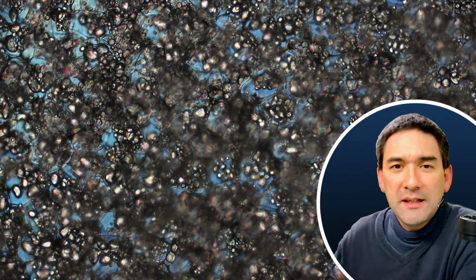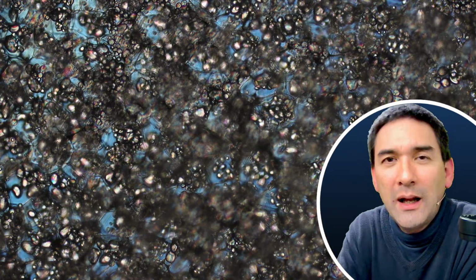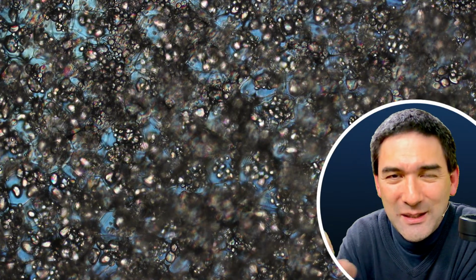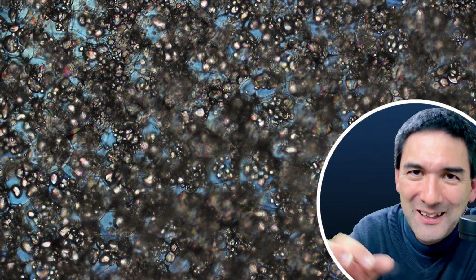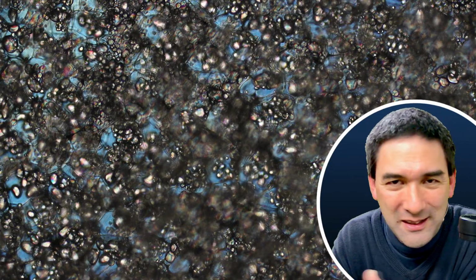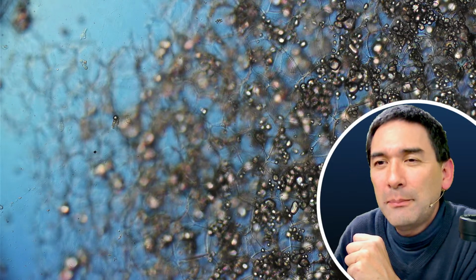I was basically saying that sometimes you could take the iodine and add it to the specimen while the slide is on the microscope stage. That is something I would be a little more careful with, because if you press a little too hard on the pipette, you might get too much iodine out, and then you might get it on your microscope optics and so on. That's what I was referring to. So this is essentially another example.